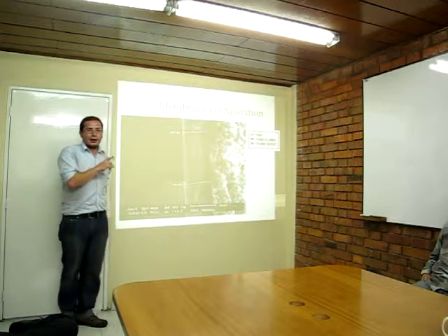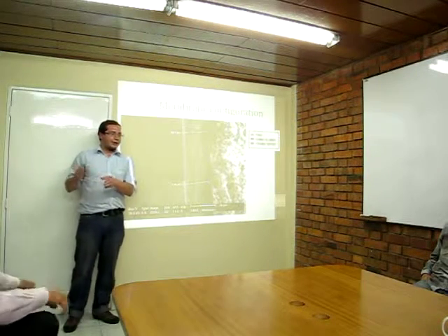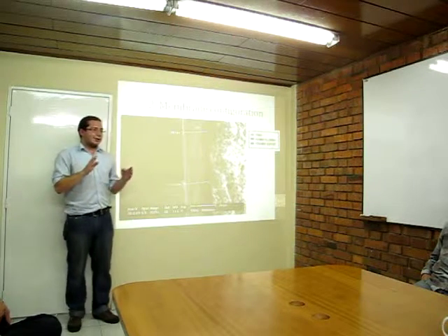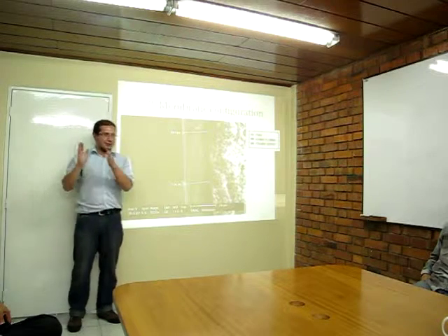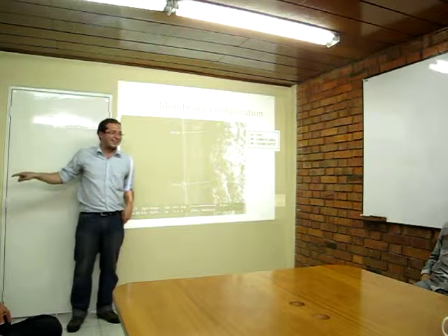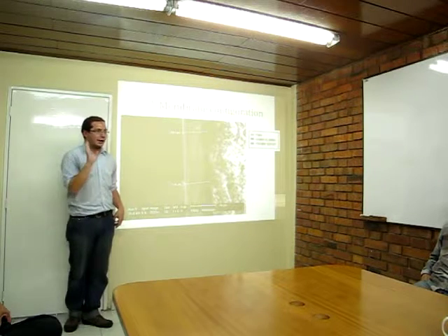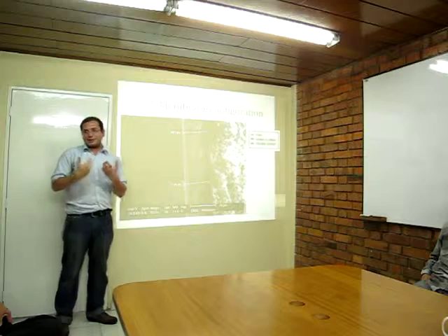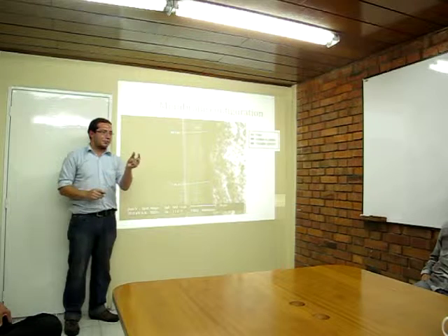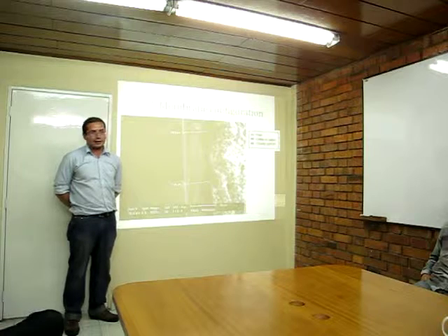And with another technique, we took 3 speeds of removal of the membrane and saw with the SEM the thickness of the membrane, and we got a linear expression with a correlation of 1. We speculate with this result that the membrane has a thickness of nanometers, but we cannot see the membrane.